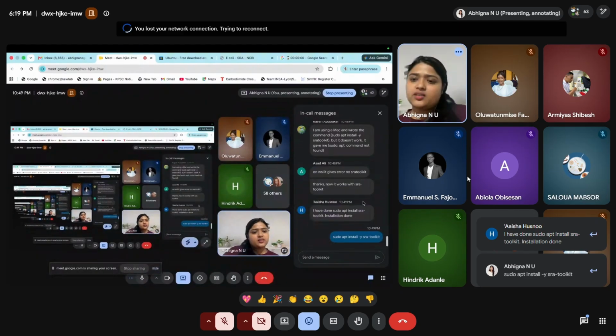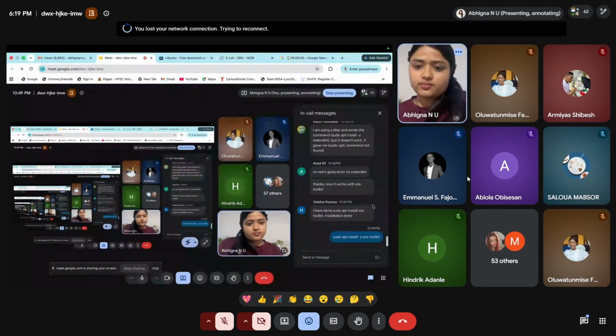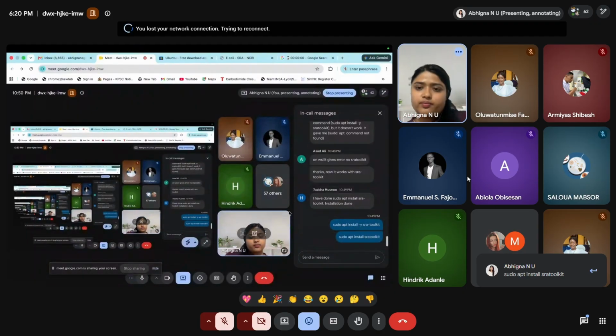Yes. Aisha, you have downloaded it. Very good. If it doesn't work on Linux, please try these commands I have given now.